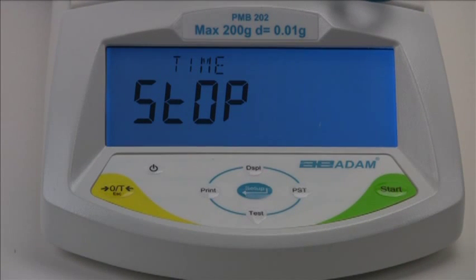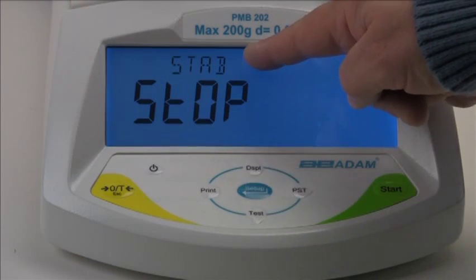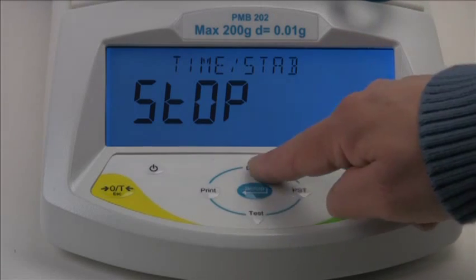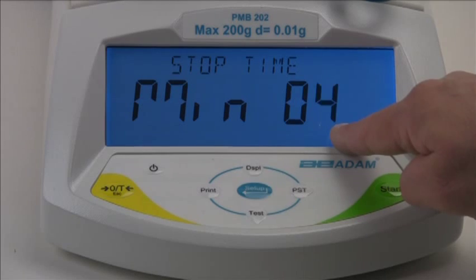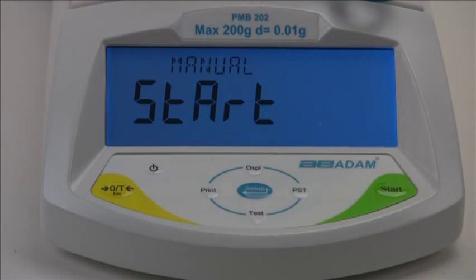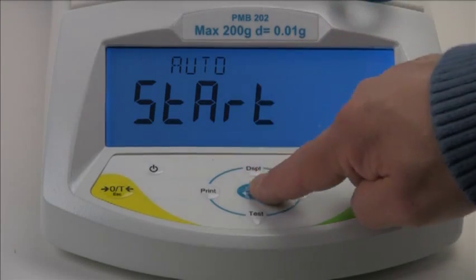Next we will select a stop condition. The test can be stopped automatically after a set time, or after the sample is stable — meaning weight loss has virtually ended — or a combination of these. For our demonstration we will run the test for four minutes, then stop. We will select auto so the test begins when we close the lid.